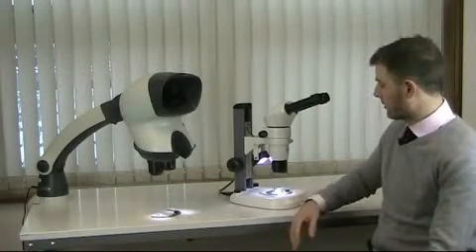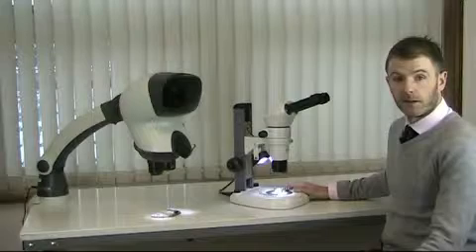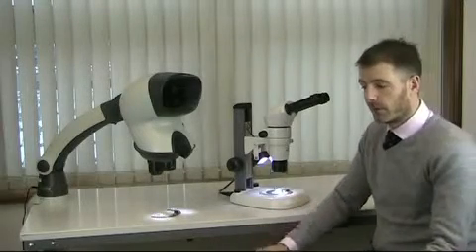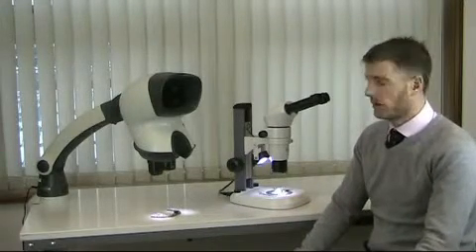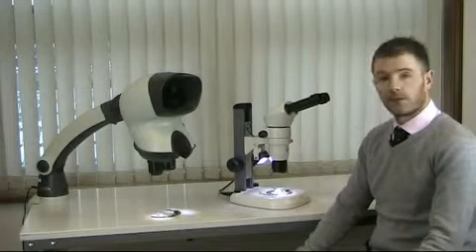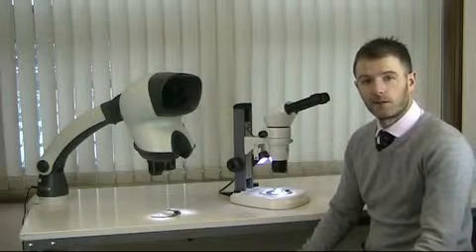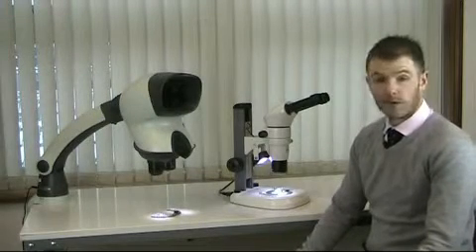Mantis Elite is very much like a conventional IP stereo microscope like this model here. It provides superb stereo imaging, has a range of stand mounts, has fixed magnification options from two times up to 20 times, plus has a range of accessories including image capture.